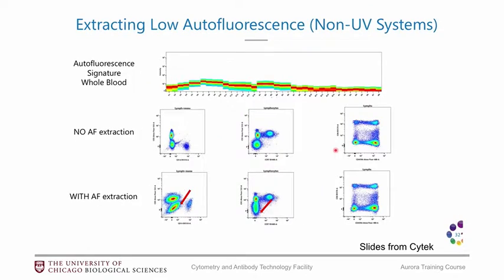It's important to note that if you don't have a lot of autofluorescence — for example in a whole blood sample — using the autofluorescence extraction can produce oddly shaped populations. It ends up looking a lot better if you don't use the autofluorescence extraction in that case. So you should pay attention to how much autofluorescence you have and only use it if you have high autofluorescence.